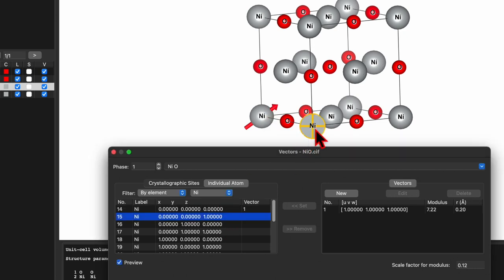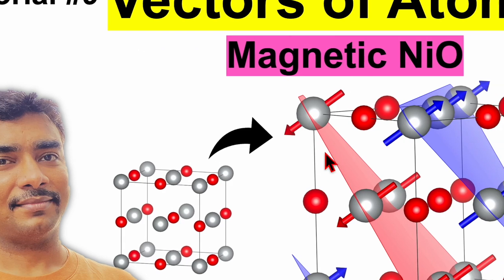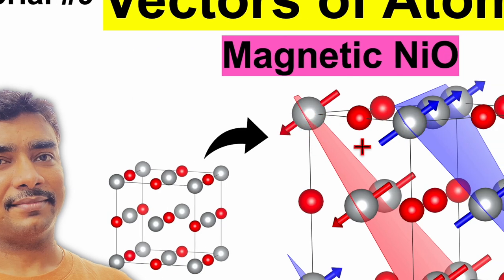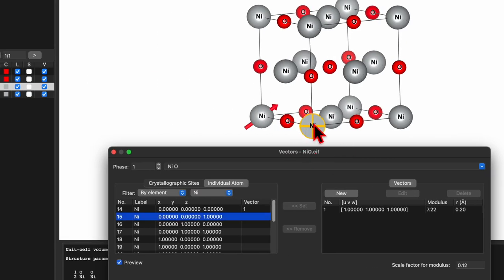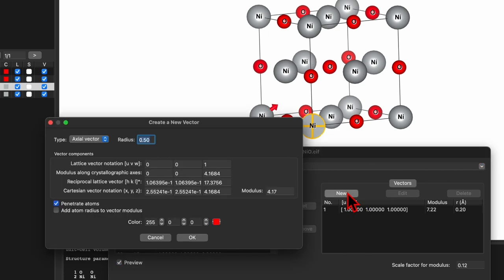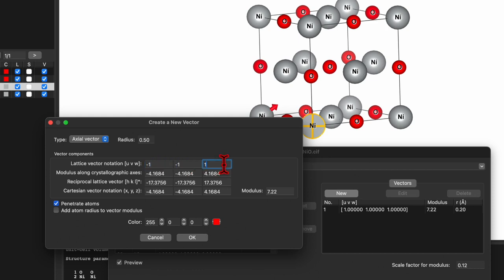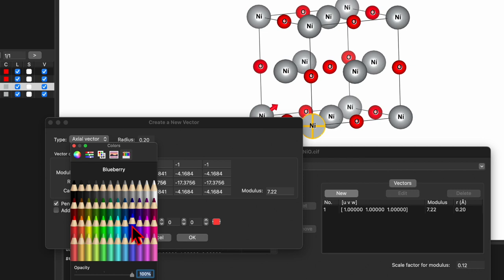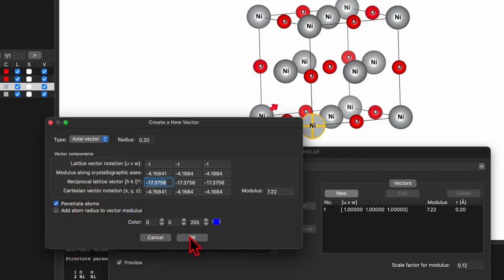Now let's select the second atom — its Cartesian coordinate is 0 0 1, so it is along the c-axis. As shown, the next-neighbor atom is pointing in the opposite direction, so we need a vector pointing in the opposite direction. Click New again, and this time set UVW to -1 -1 -1. Set the radius again to 0.2 — remaining settings are the same — but change the color to blue, then click OK.